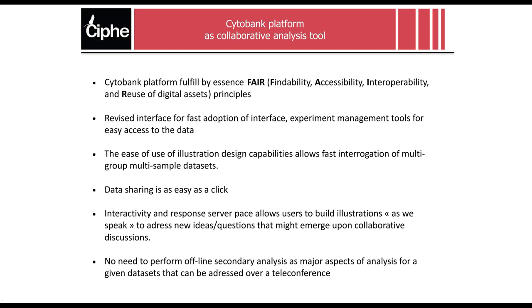Now, since there has been a lot of work by Beckman Coulter and Cytobank to improve the interface, I find the new interface really nice because it allows fast adoption by new people.